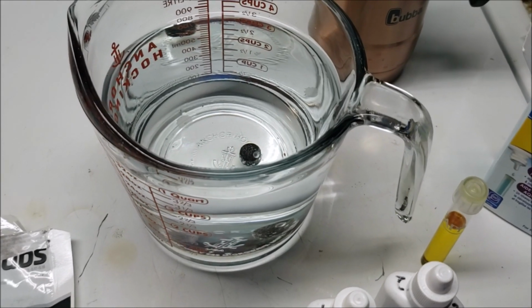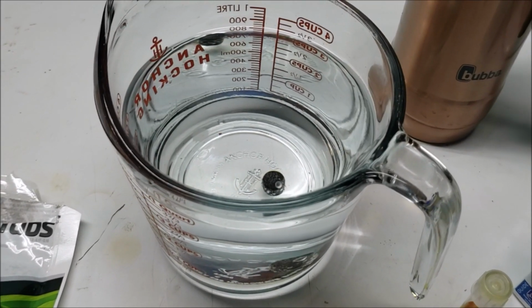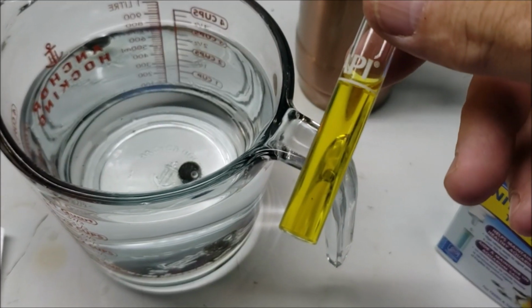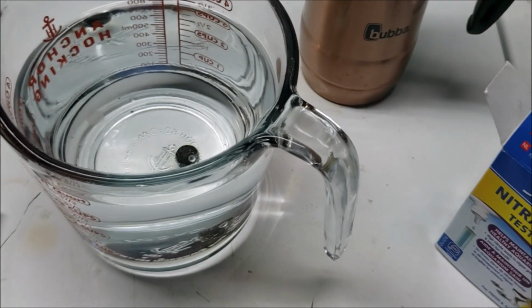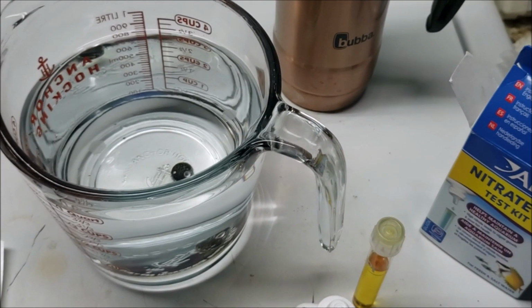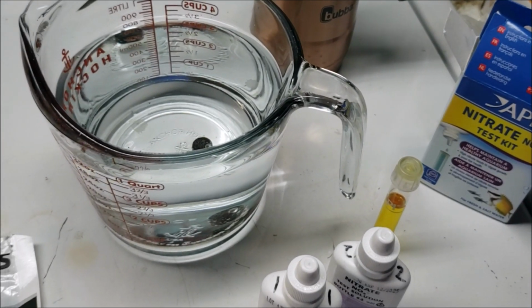I just want to find out if there's enough nitrogen in there to even affect the nitrate test. So we're at 0 now. Again, this is RO water, so I knew there was going to be nothing in it, but you've got to do the preliminary test so that you can show that there's nothing in it. So we'll come back later and see what happens.